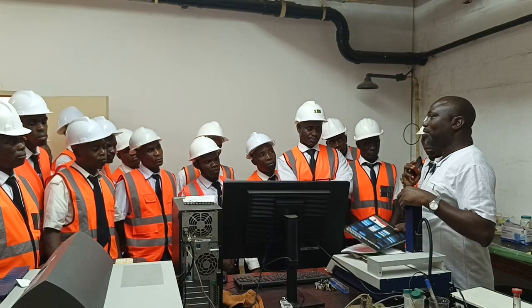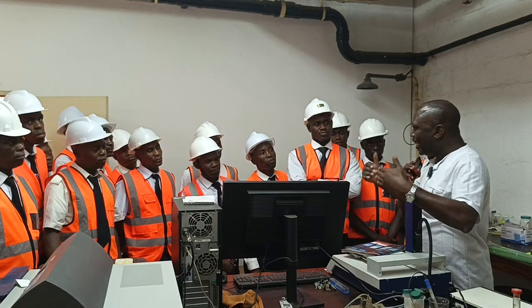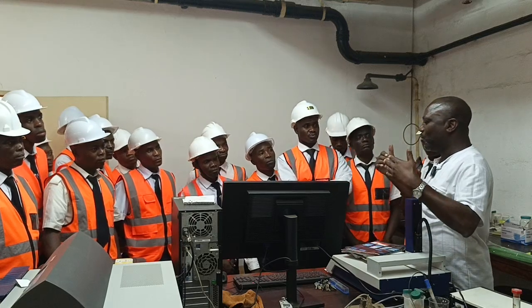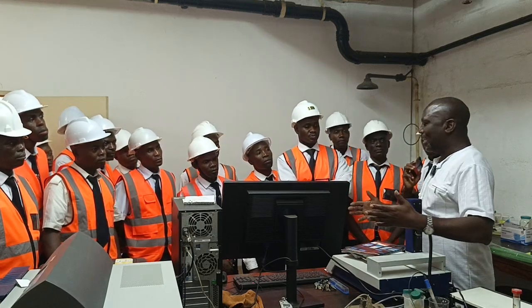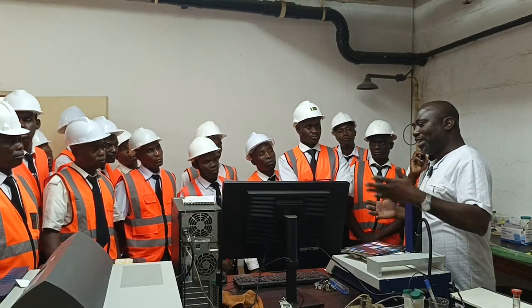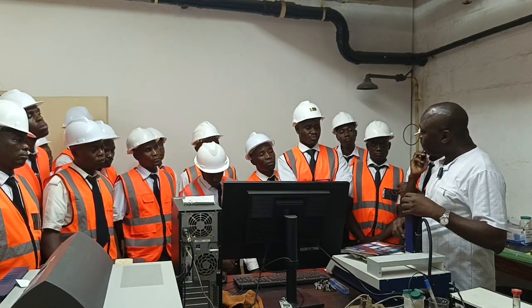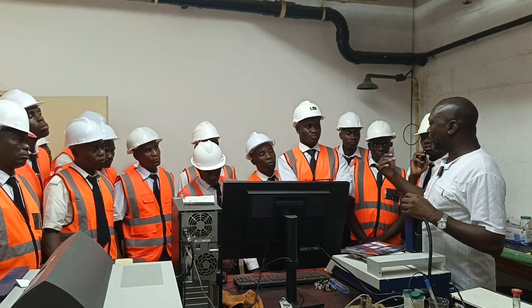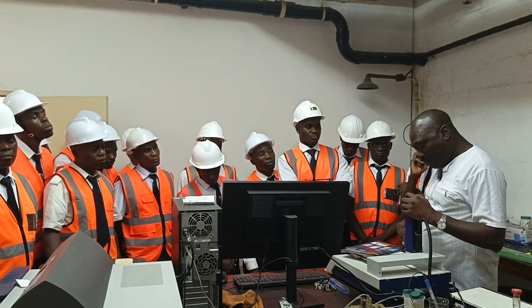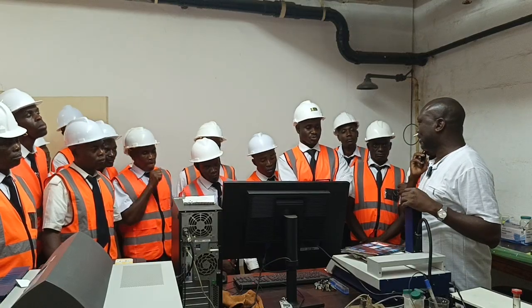Yes. For your investigation, maybe you just want to know the name. If TNT, trinitrotoluene, is present, it will give you yes, it's present. But for quantification, that's when it will calculate how much, depending on how much you are putting there. In that volume that you put here, there's so much TNT.